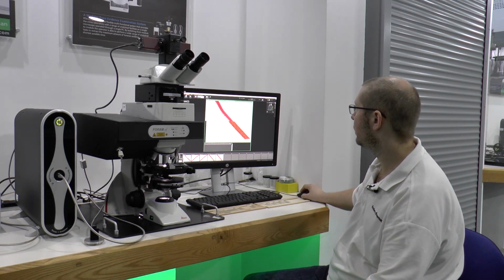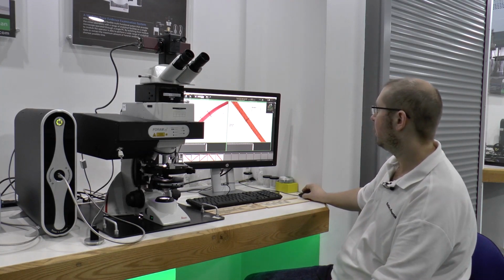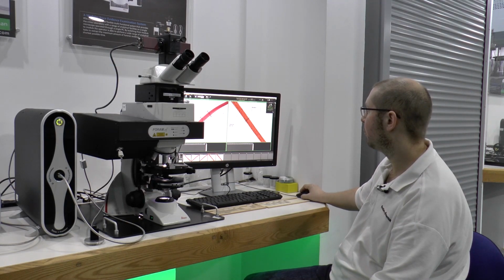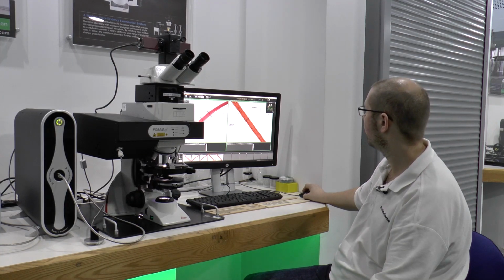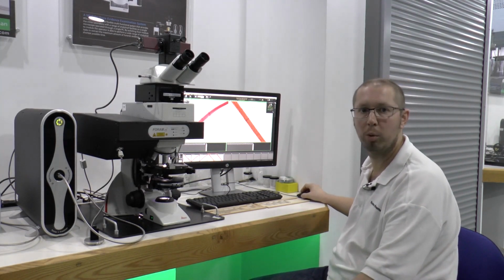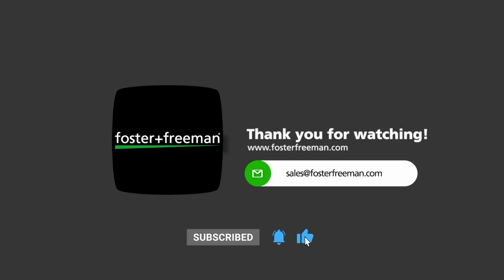If I go back to the side by side, again I can very quickly drag and drop the images that I recorded earlier, and here we can also see that the size of the fibres are quite different. The fibre here on the left hand side is about 15 microns, and then the other fibre over here, we're comparing it to, is about 20 microns. So quite easily we can generate high quality, high resolution images and use the calibrated measurements function to take accurate measurements of our samples.